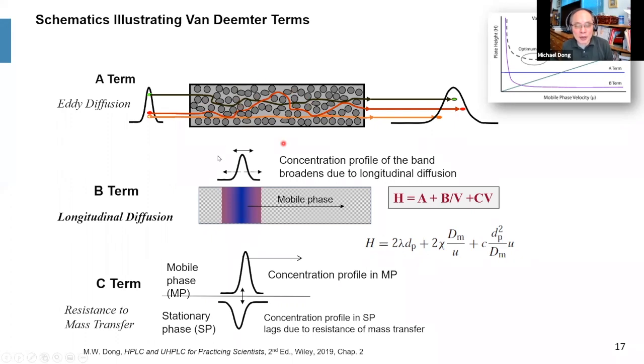There's not a lot of throughput, right? Now, why is that? Because if you have a 1 microliter caffeine solution, you have billions and trillions of molecules. They go down the column through a random walk. Every time they hit a particle, they go through the interparticular volume of the column, and they diffuse inside into the pores, and they have to diffuse out. So there are billions of interactions, except you don't care about it. It happens automatically without you worrying about it.